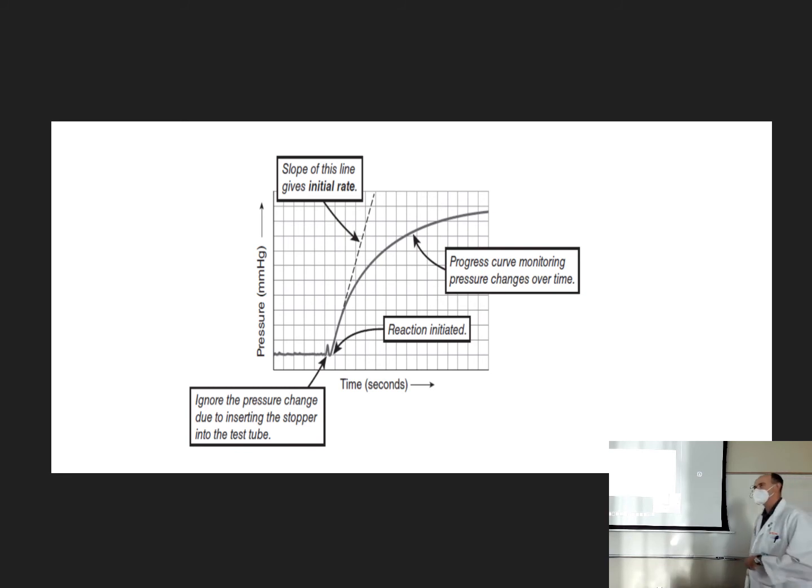What you're measuring is how much oxygen gas pressure is being created as that reaction takes place.